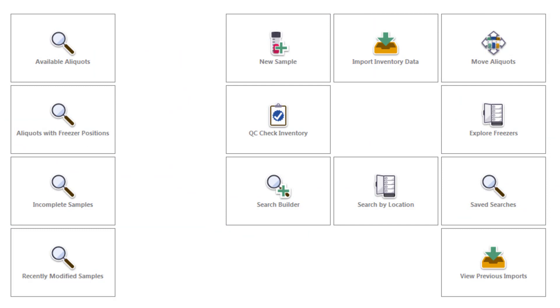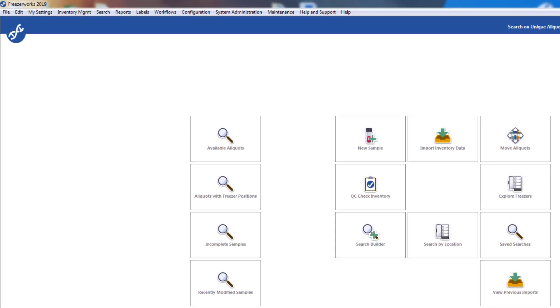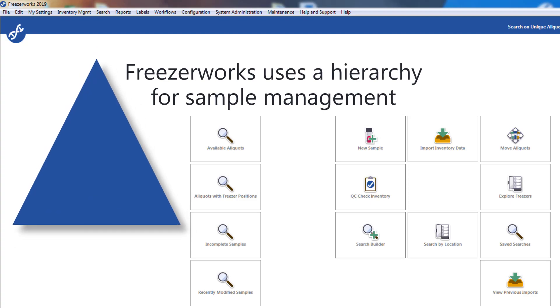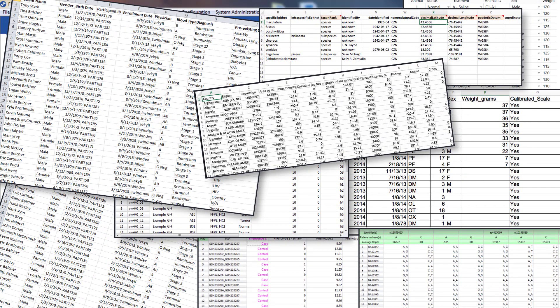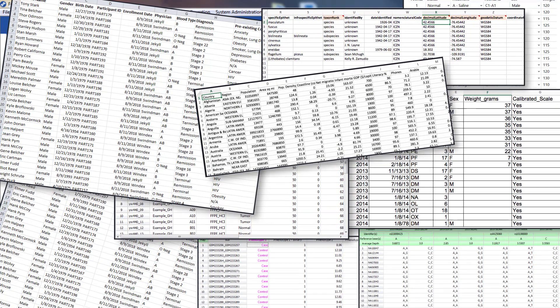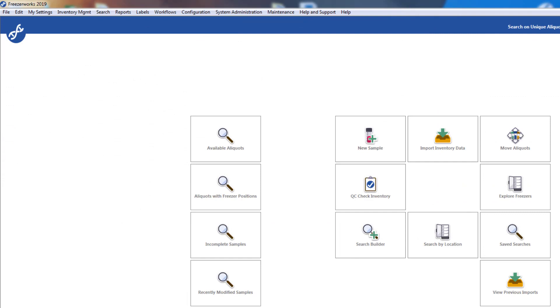Hey guys, welcome to the Freezerworks 2019 learning series, your visual guide to our sample management software. I want to discuss just that — sample management. Understanding how Freezerworks manages data about your various specimens in a hierarchy, before configuring fields or entry forms, will ensure that your previous system, which may be a challenging number of unsearchable spreadsheets, is brought to order upon implementation of our software. We'll start with the basics, and then I'll briefly touch on how the Summit and Pinnacle editions add more layers to our hierarchy.